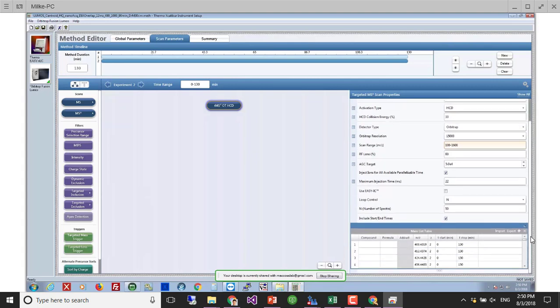And then if I just scroll down here, I've got that same list of m/z targets, right? And they're, again, all set up as charge 2s. And they're going from 0 time to 130 time. So this is basically as if I were setting up a PRM-y kind of DIA setting. Does that sort of make sense? They're really exchangeable, and you can do one using the other type of setting operations. Okay? Is that good? Any questions about this type of instrument or how it's different?